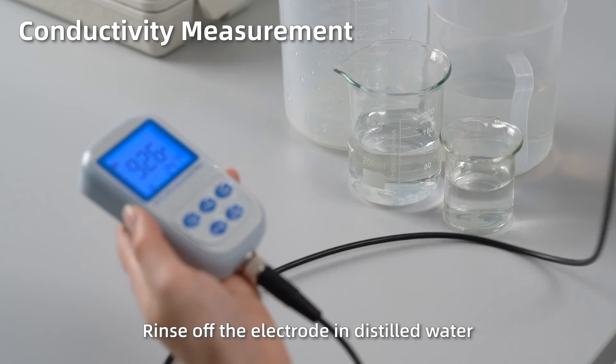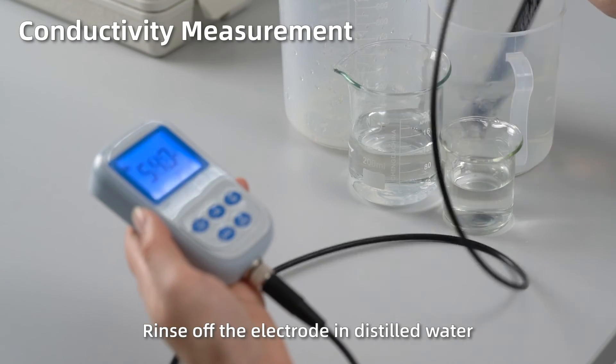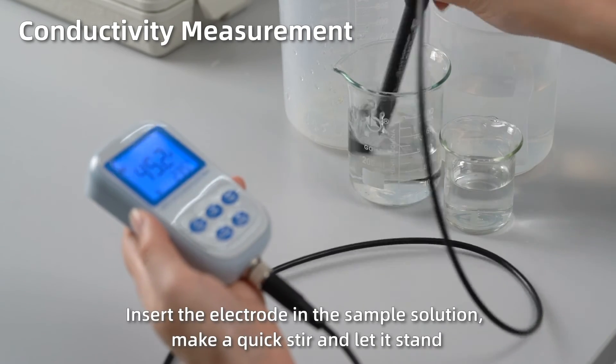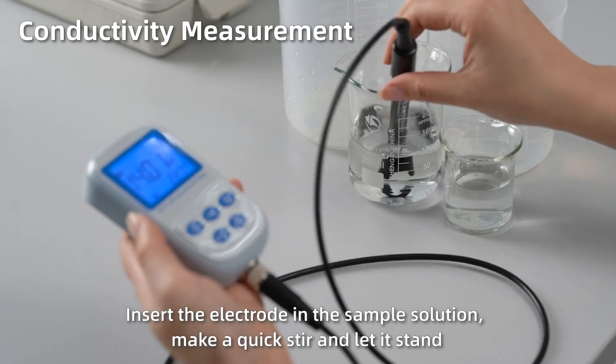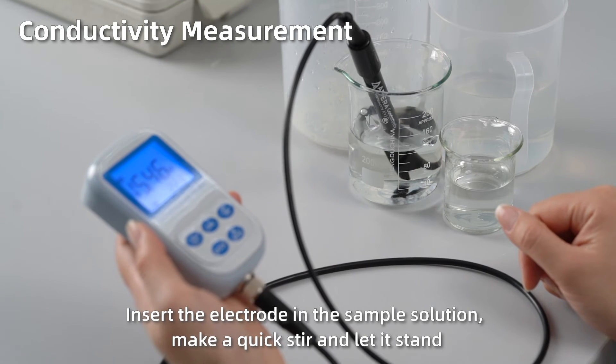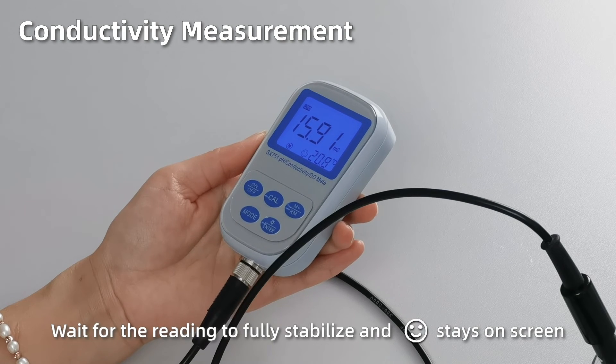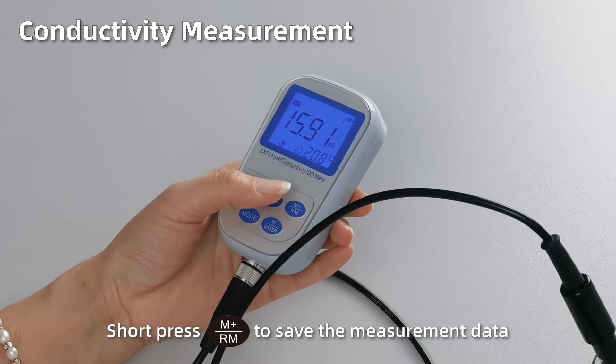Short press M plus to save the measurement data. Conductivity measurement. Rinse off the electrode in distilled water. Insert the electrode in the sample solution, make a quick stir and let it stand. When the reading is fully stabilized and the smiley face stays on screen, short press M plus to save the measurement data.